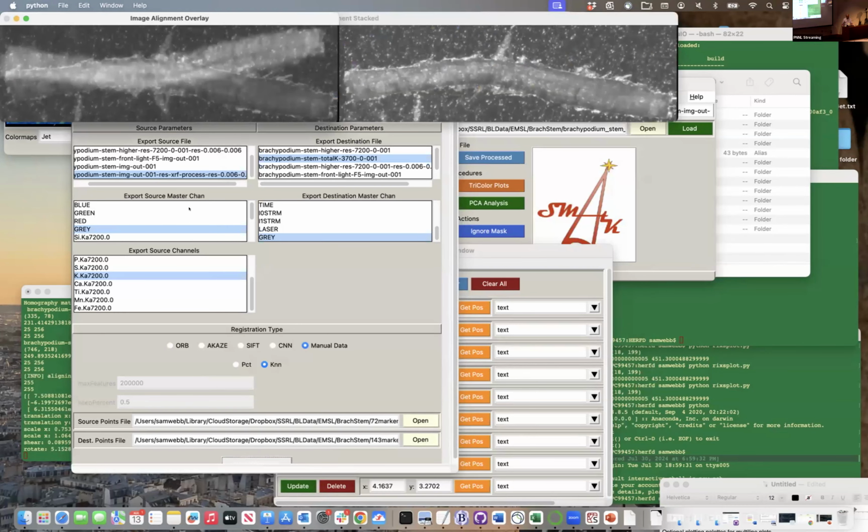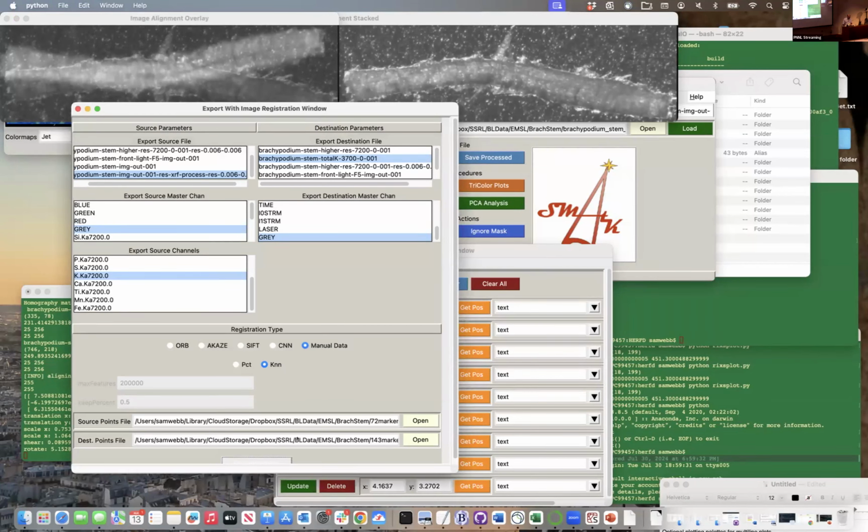And it's much better, but it's on a flip. It's like there's always something, right, that's going to stop you, right? So in this case, now I can actually take my data and flip it around and make it work. It does work. But these are the kind of things that you will get to when you try to register your data. These are common problems that we always run into incessantly, unfortunately. But it did look pretty nice.